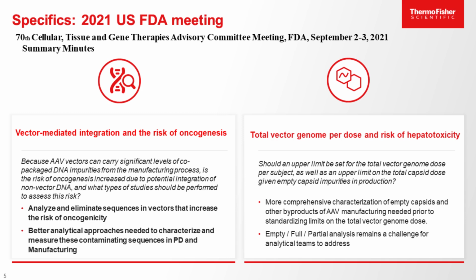Some of these therapies are showing tremendous success at curing genetically related diseases. However, the risk of adverse effects in clinical trials has heightened the urgency in addressing the safety and efficacy of these viral vector-based gene therapies. Some can likely be addressed by analytical teams in defining and monitoring the CQAs of the drug product itself. This will require employing advanced and perhaps novel analytical techniques by analytical development teams, especially in comparison to the analytics applied to the characterization of traditional biologics such as monoclonal antibodies.